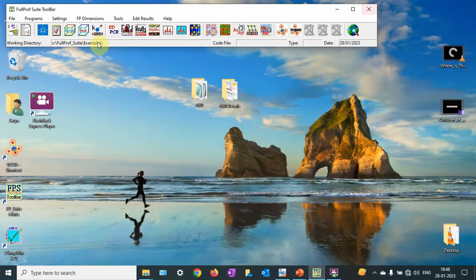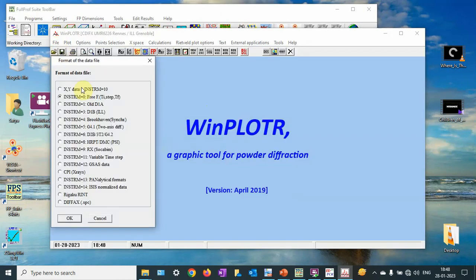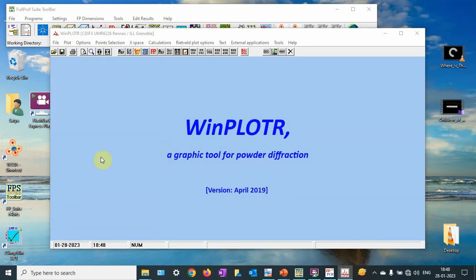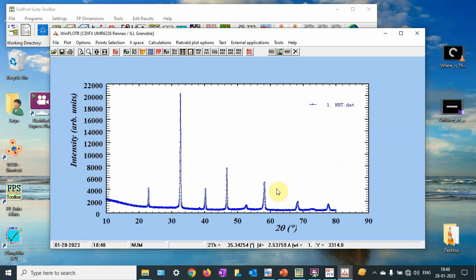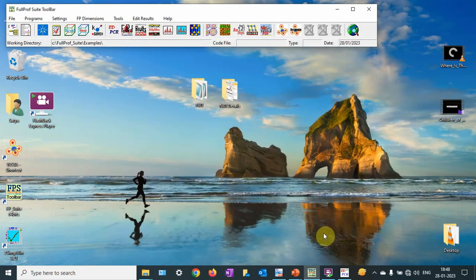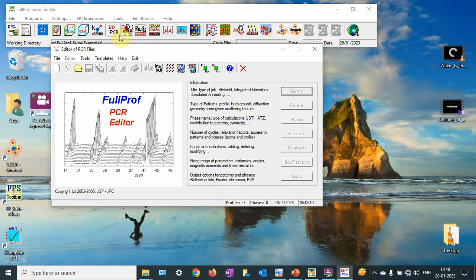Let me open the FullProf package and go to EDPCR. Let me verify the data is running. I would always recommend converting the data from the CIF file to PCR, because if you use other PCR files, there are hidden parameters that may prevent your data from converging and fitting. So it is always recommended to convert CIF to PCR.